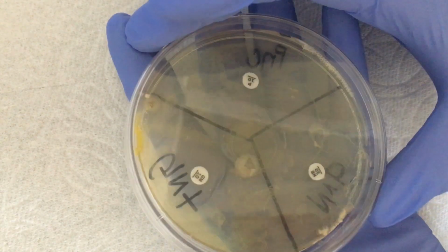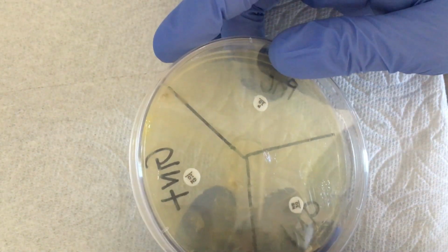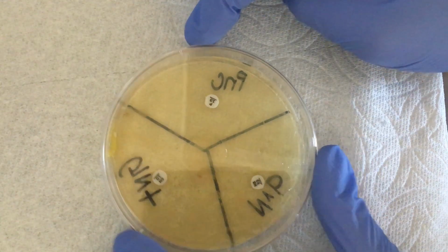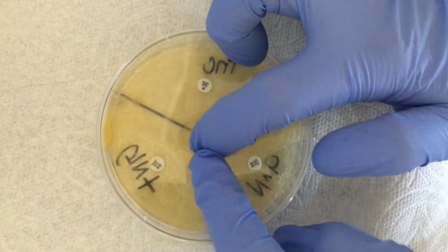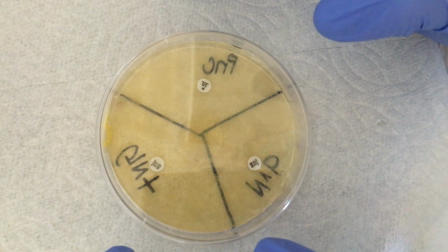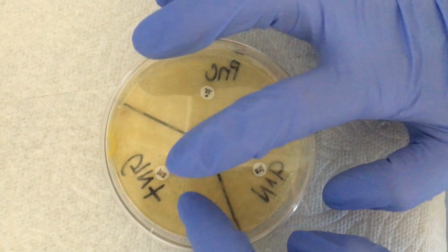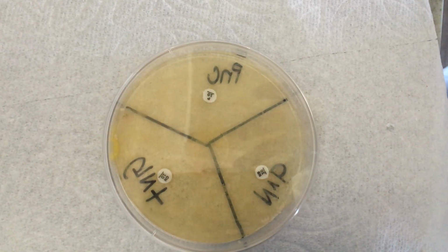What does this say? Well, besides being contaminated, the point of this test is to see what stops this pathogen, right? And it's fascinating to me that they use this in hospitals. So Dr. Stansel, let me know what you think about this, because it's quite interesting that this particular antibiotic, gentamicin, stopped the S. epidermidis and the rest did not. Thank you.